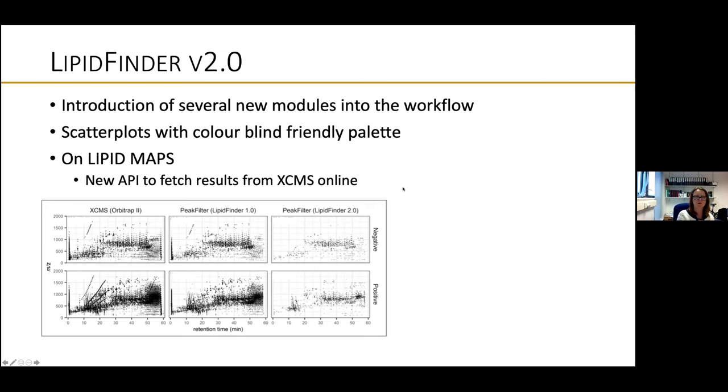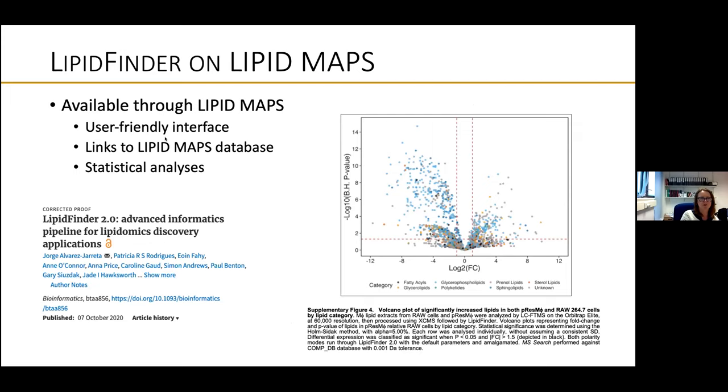So on LipidMaps, there's a user-friendly interface. Jorge is going to show you links to the database so you can search, and you can also do statistical analysis such as volcano plots like this, divided into the different lipid categories so that you can look at them separately. And then we published an application note there. So Jorge is going to come in now and do a tutorial.